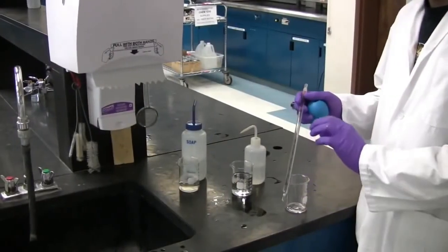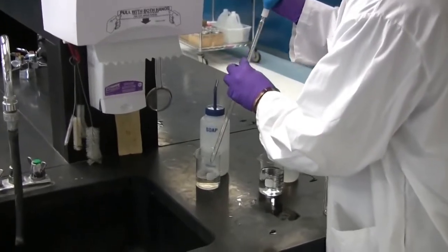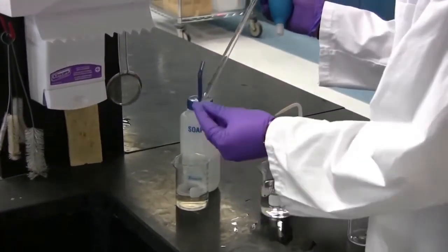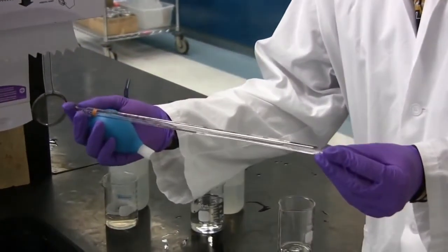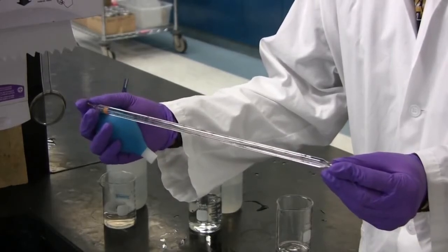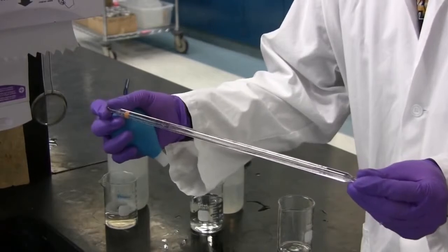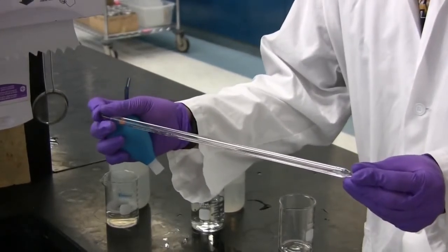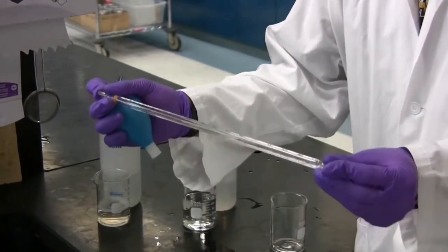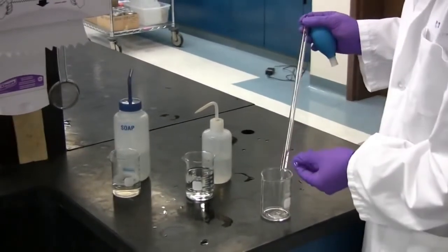When using either pipette, start by placing it into some soapy water and withdrawing some liquid inside of it. Next, you need to tilt it back and forth and ensure an entire coating of the inside of the pipette without spilling any liquid. Lastly, you need to rotate it towards yourself to ensure coating of all sides. Once that is finished, you need to drain this into a waste beaker.